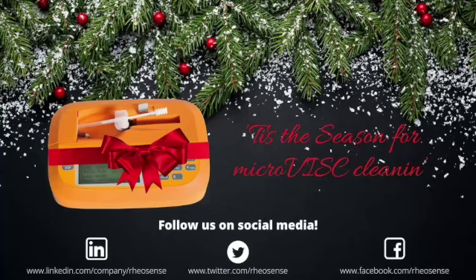And then let's see, more questions. Sure. Right now, is there software available for the microVISC, or is it all just in? Yeah, so there's definitely software available for the microVISC.